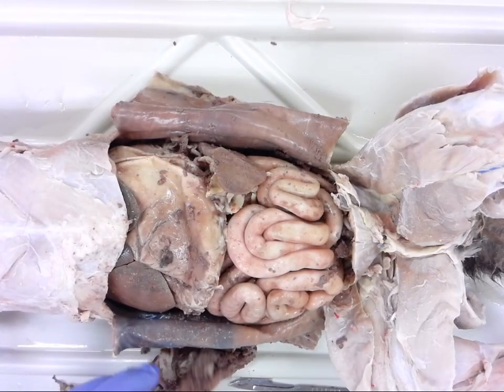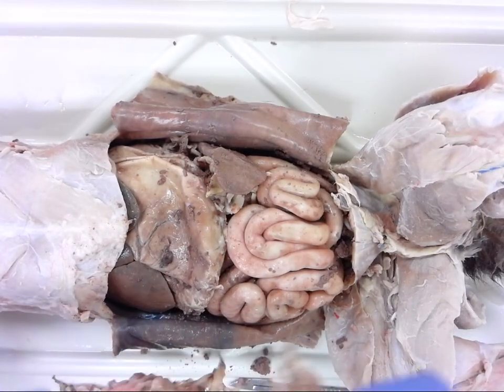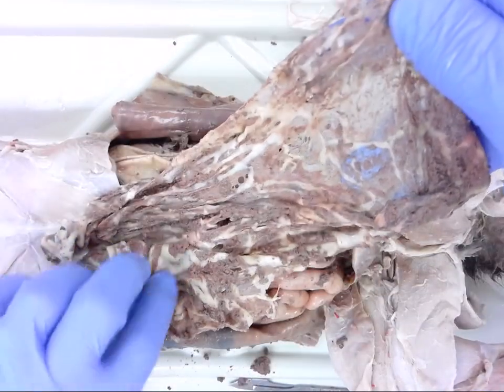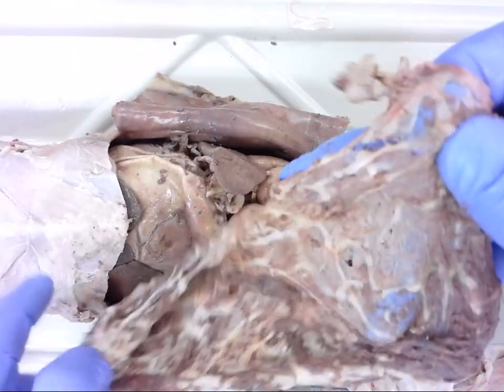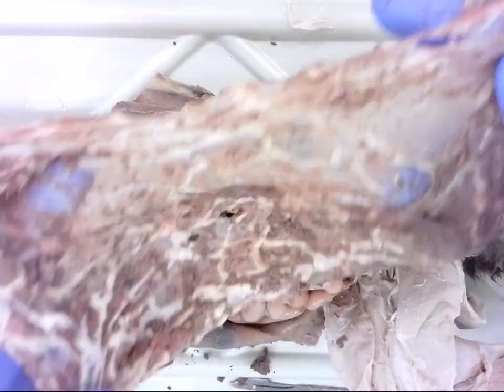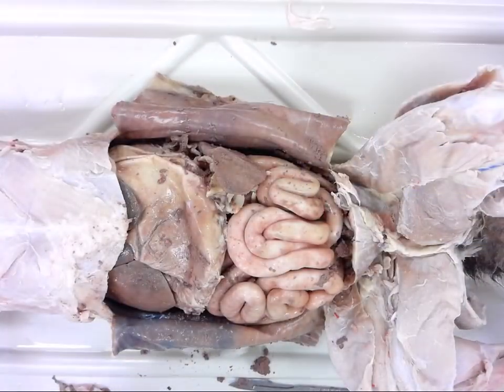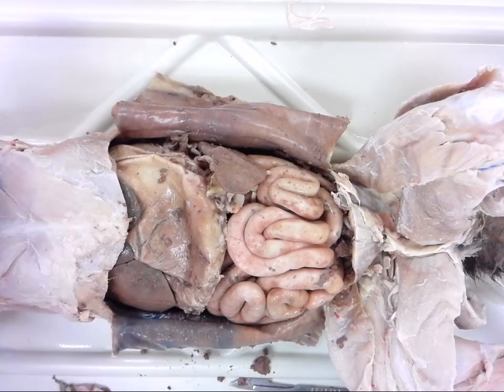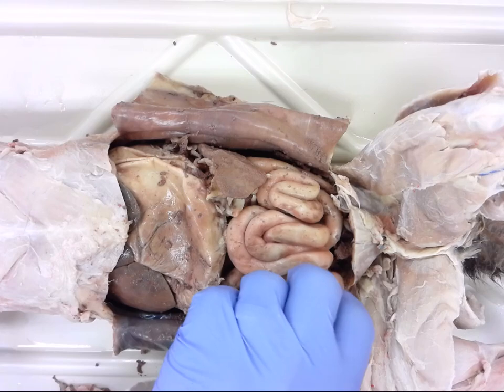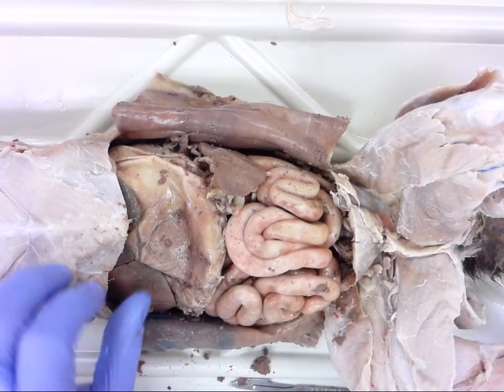So you can see as we hold it out here, it's actually just a very thin membrane with a lot of fat intertwined. Okay, so once you've taken a look, we can remove that and set it off to the side, discard it later. So now that we get that out of the way, you'll see there is some blood left. We can clean that out as we go through it.